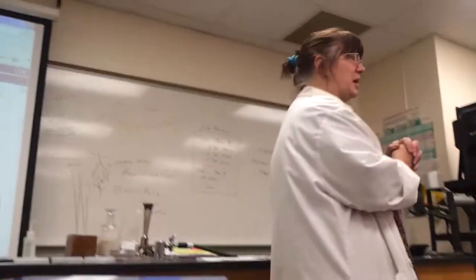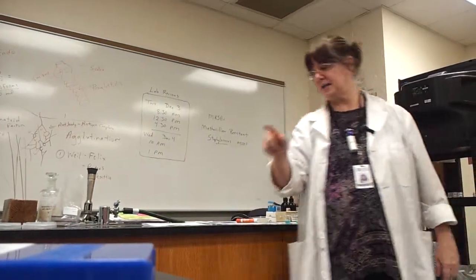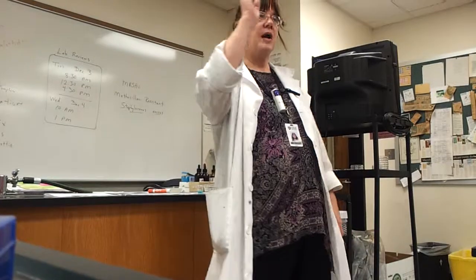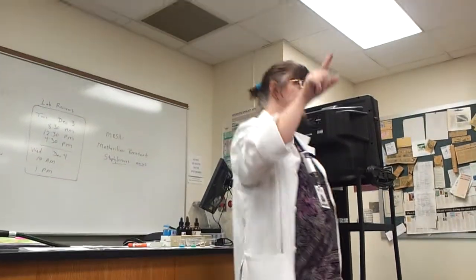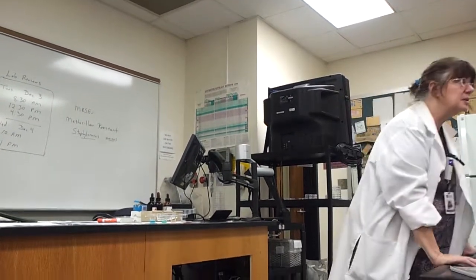Now, you've got about 15 minutes, but you go about an extra 10 minutes beyond that before we have class to look at everything. Biochemical tests, I'll put them back. Immunodiffusion, rheumatoid factor test. You have the EMB plates and the MacConkey's plate back here. Remember, red or color means positive lactose fermentation, no color means no lactose fermentation. Yes. I need to know for that one.